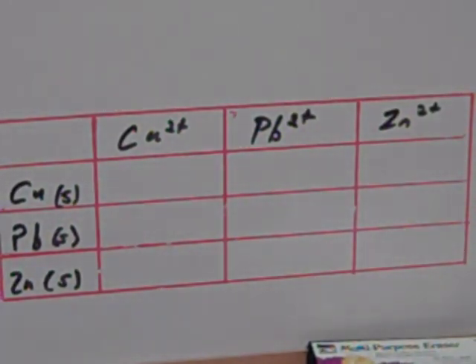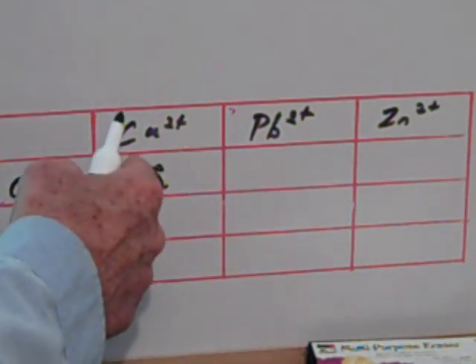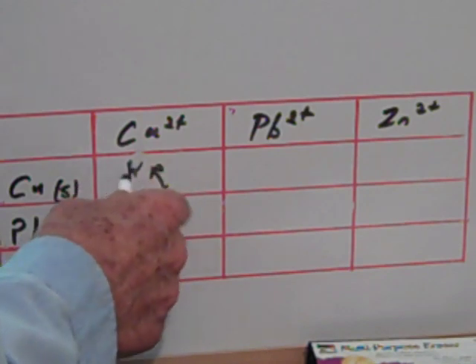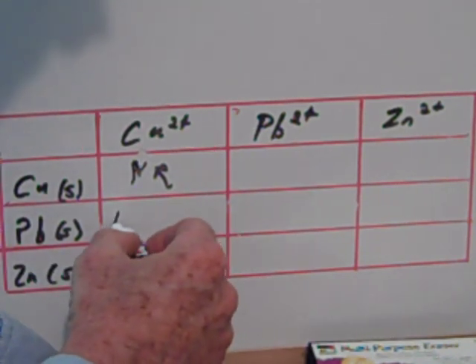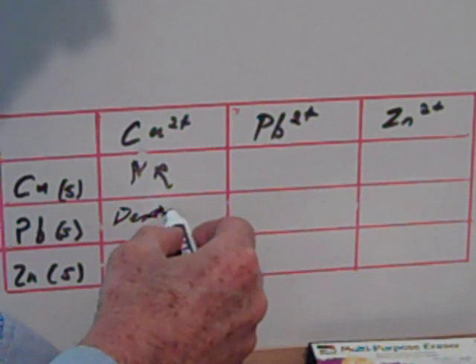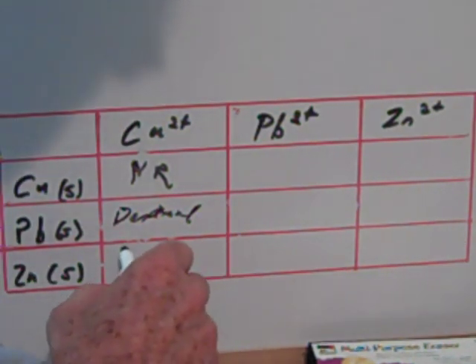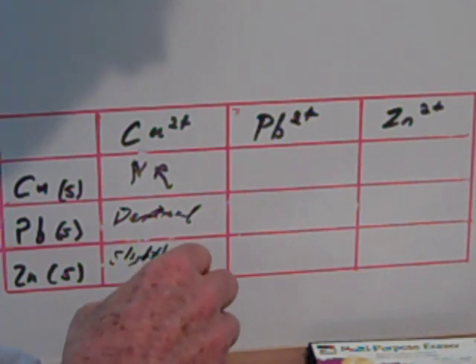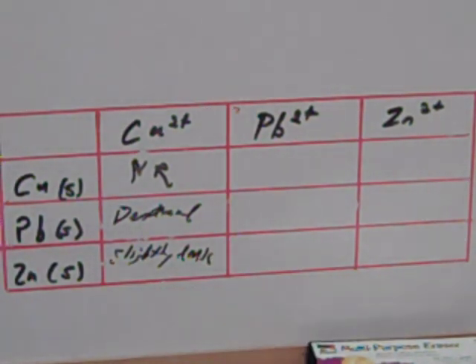All right. Then we're going to go over to our whiteboard, and we're going to put in our observations. The copper, no change, so we'll put NR, for no reaction. It's hard to write like that. Can't write in this position. The lead darkened. So the lead has reacted here, and it's been oxidized, and the zinc slight change, slightly dark. Okay, hard to read that, I imagine.